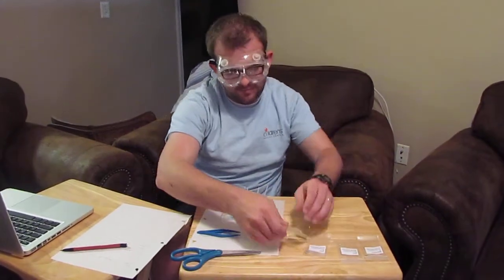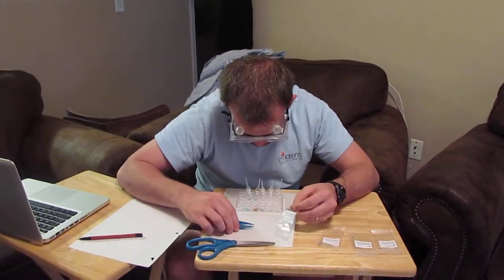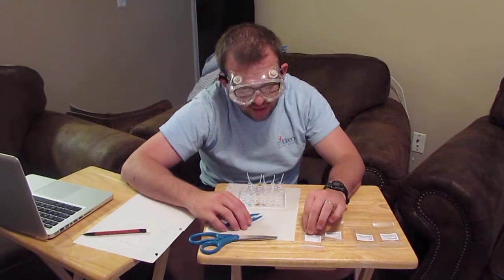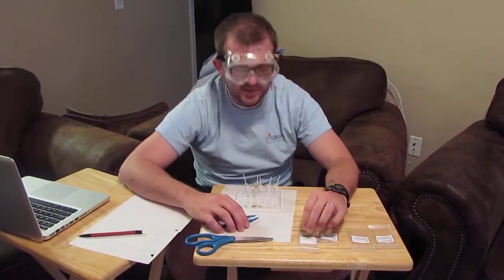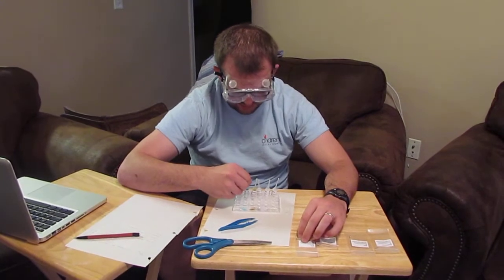And the last one is iron, and it's just a nail. But I've already seen a little bit of reaction, so I'm going to take a minute and observe and record my answers before I put my iron into my copper sulfate.